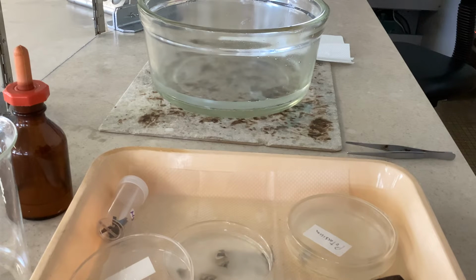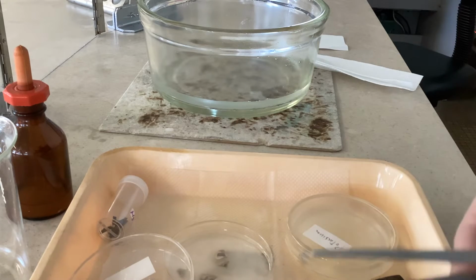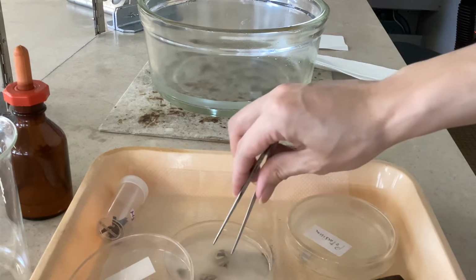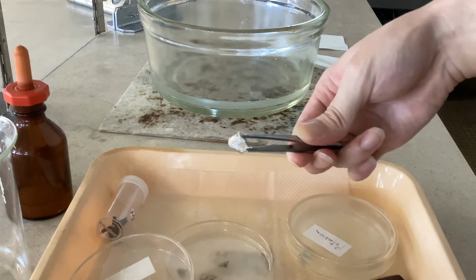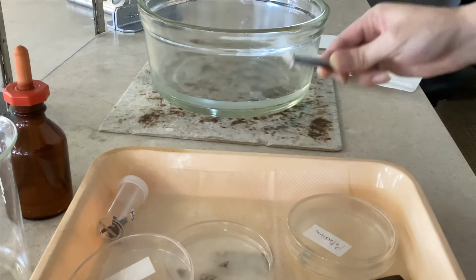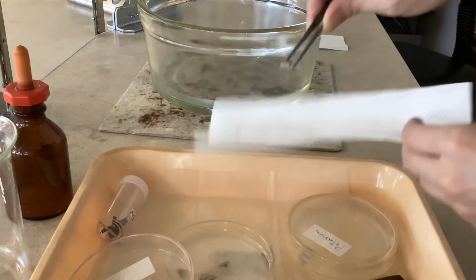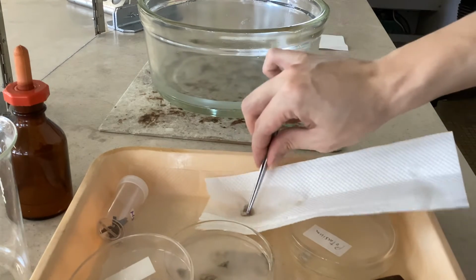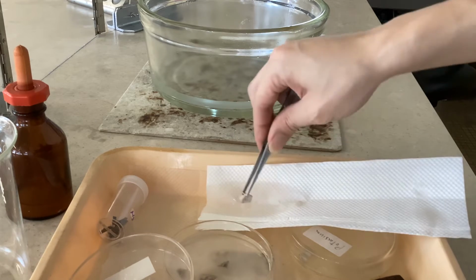And because of this oil layer, if we would like it to react with water, then we have to use tissue paper to remove the oil first. Just use a piece of forceps, and then take out a piece of it for you to observe. It has an irregular shape, and then put it onto a tissue paper to remove some of the oil on the top.